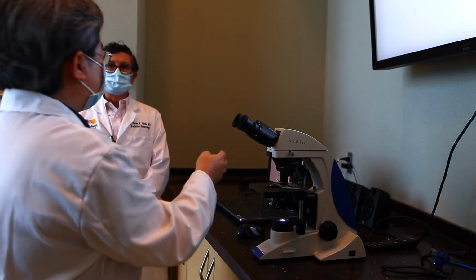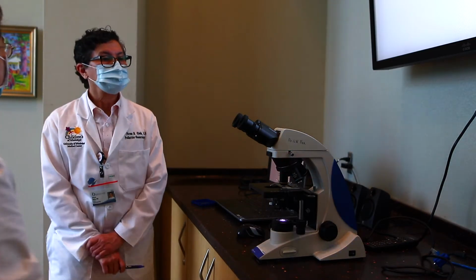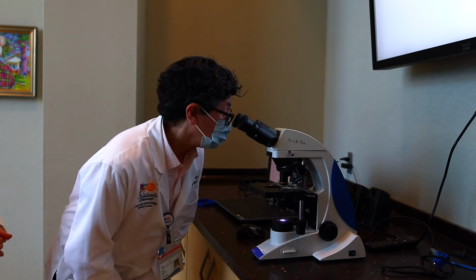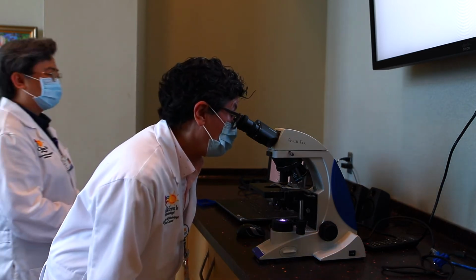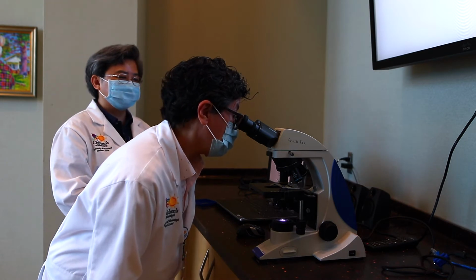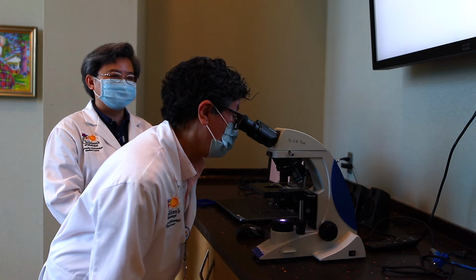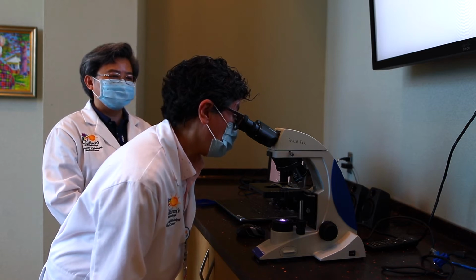And you can see from the eyepiece. Oh, the eyepiece, because it is close to the eyes, isn't it? Yes, that's right. Oh my goodness, I can see them. They are like red, blue. Oh my goodness, I can see one with a fan. It looks like it's smiling at me.